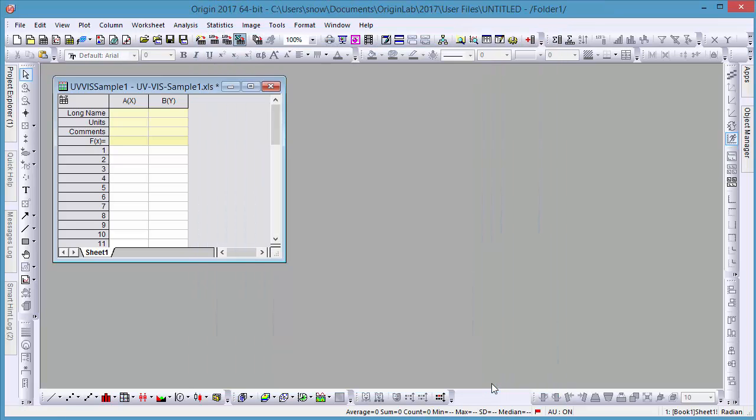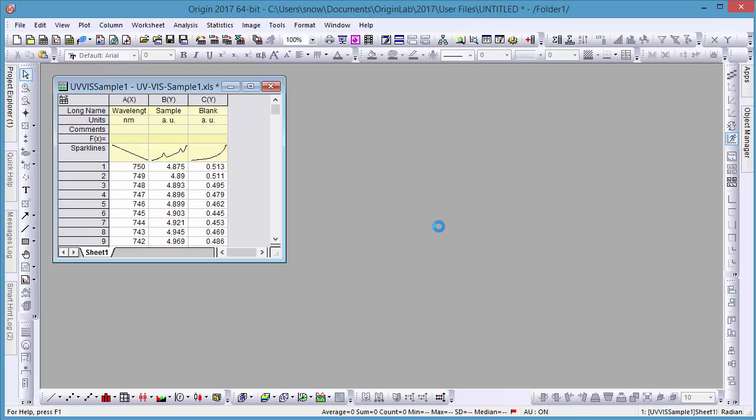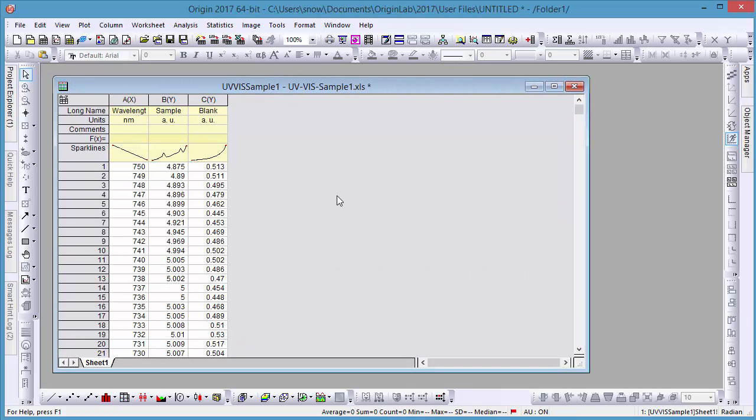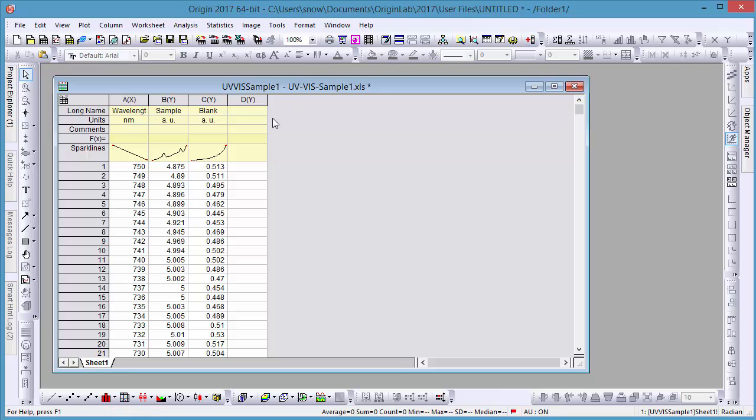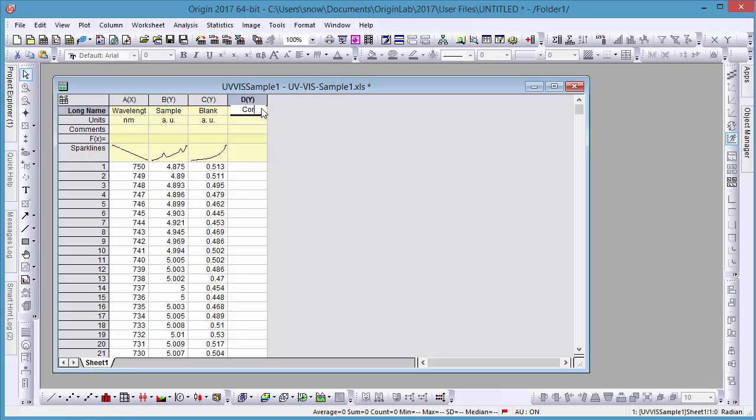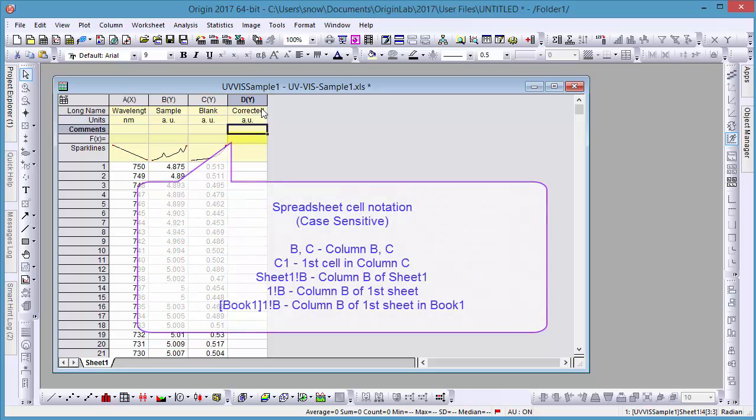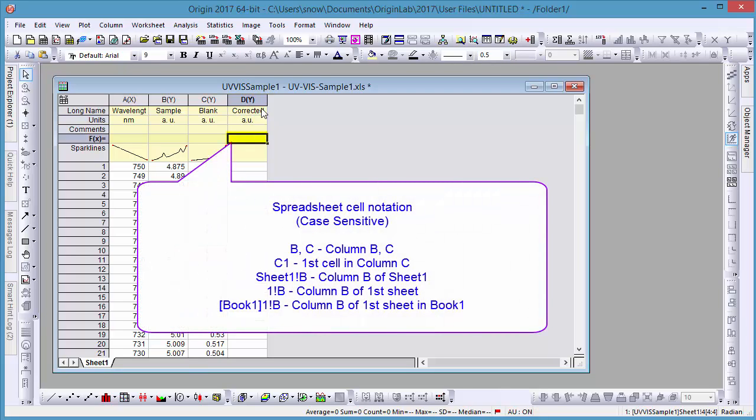Now that our data is imported, let's make some modifications. First, we'll add a new column for corrected data, which we'll calculate by subtracting the blank data from our sample data. You can use the F of X row to enter any formula with Origin scripting language, LabTalk.